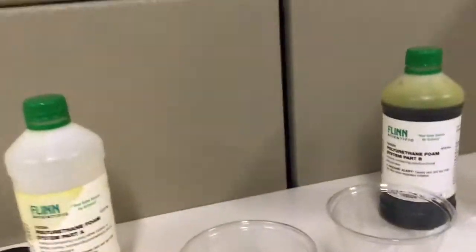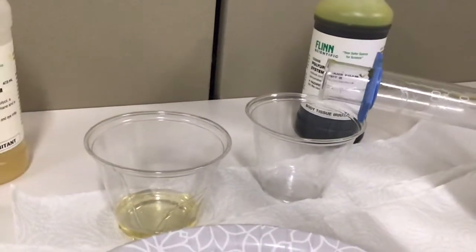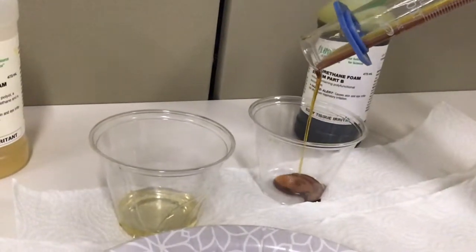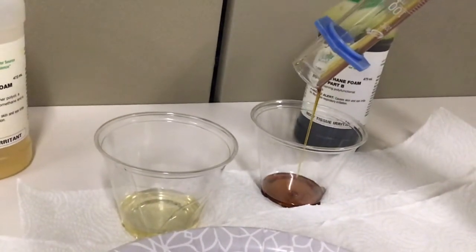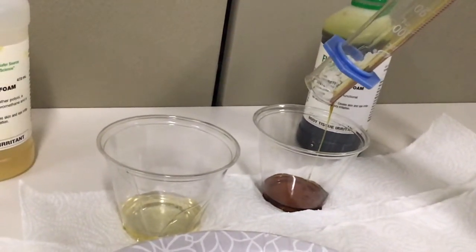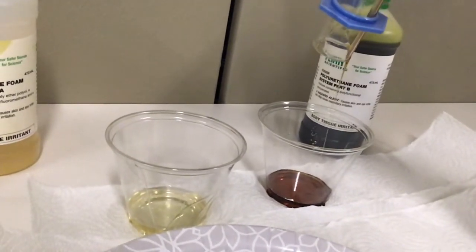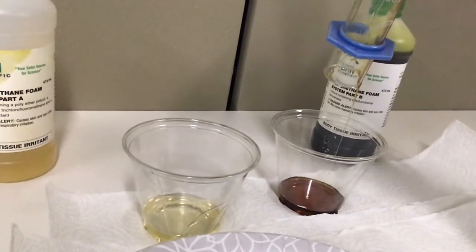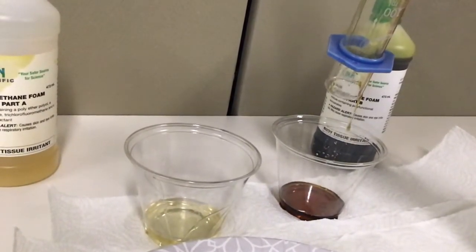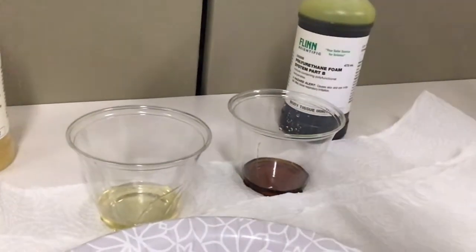And then I am going to be pouring the 20 mils in this cup of solution B. All right.